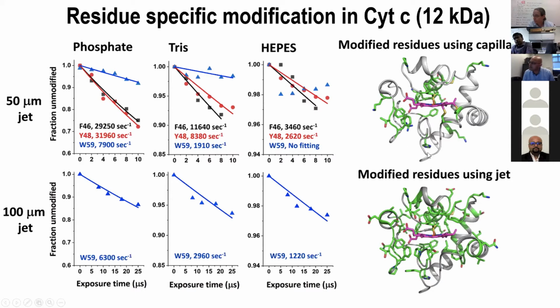Another thing, this needs more study because we did only one protein. We were able to detect more sites. I think this is because of the high quality data, because you have more oxidations. Mass spec will detect more sites, which we were missing before because of the low yield of the modifications.